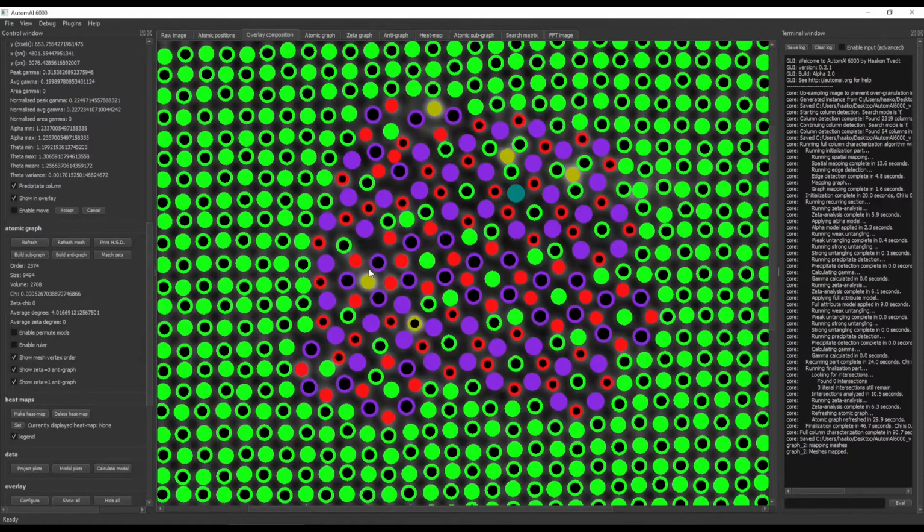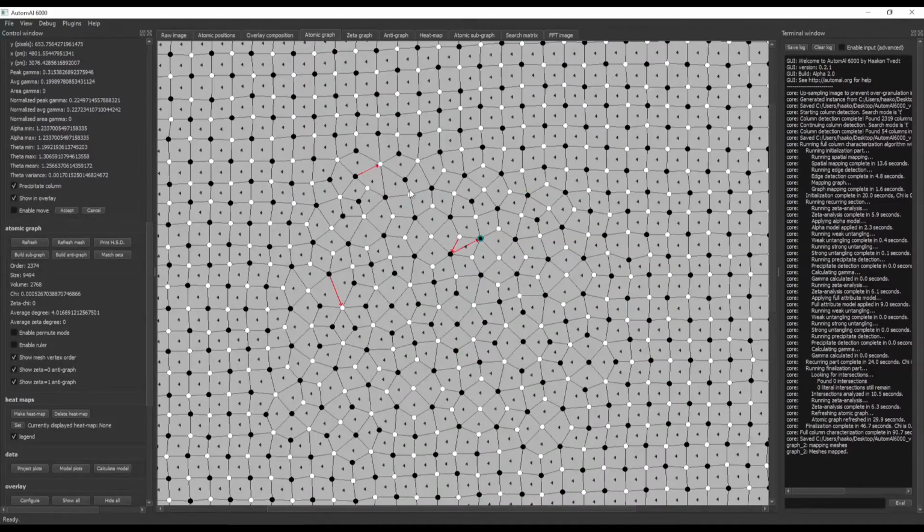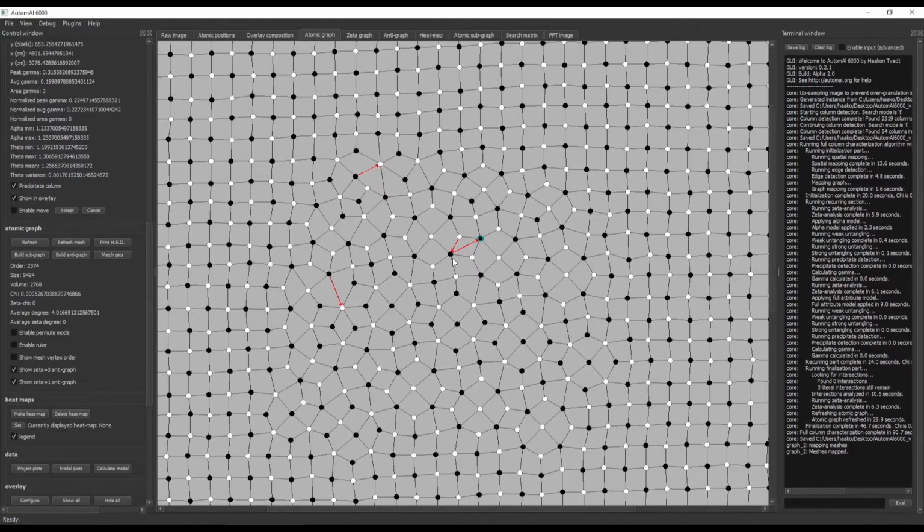And as you can see, to summarize, our knowledge about these structural principles will have to be used in conjunction with the algorithm, because, as I said, there will always be some problems that will need some attention. But at least the atomic graph tool like we have here is very helpful to go through that quickly.